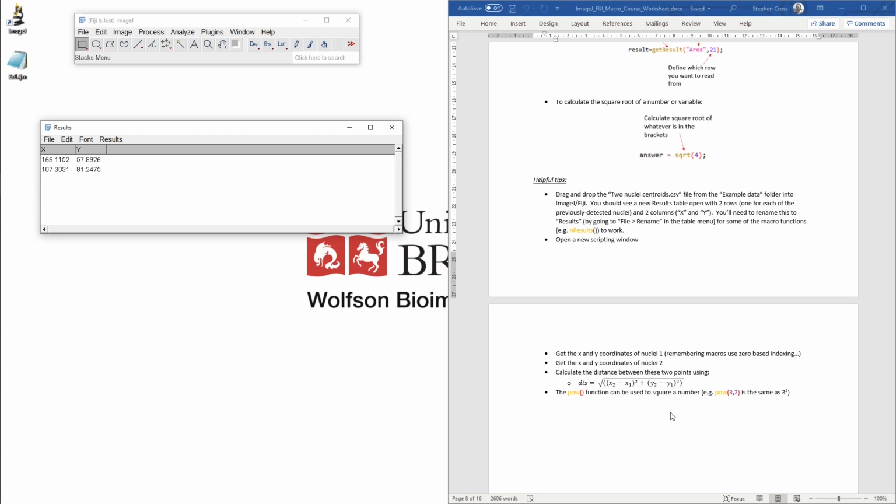So again, I will just give you a moment to pause the video, and then once we resume, I'll talk through one example solution for this.